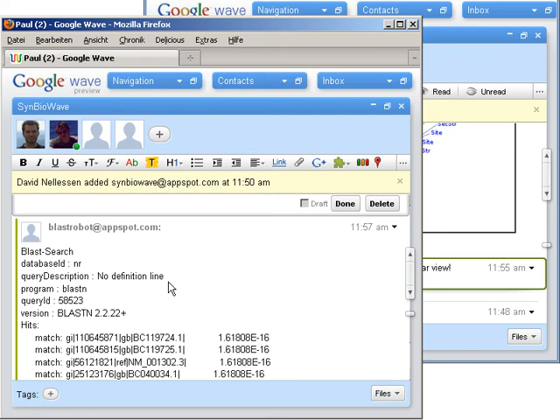So you see, the look and feel is not very good yet, but the idea right now is to demonstrate the concept of SynBioWave. The idea is to provide a basic framework with some basic functionality like additional toolbars, displaying of sequences, import, export, and that stuff. And don't forget integration of web services like Blast. Yeah, that's right.